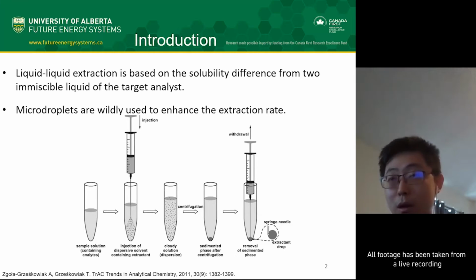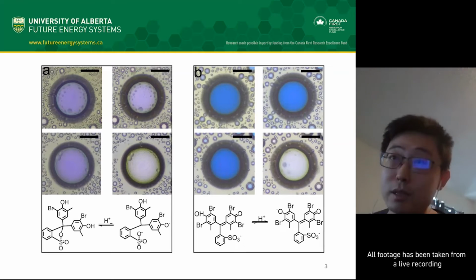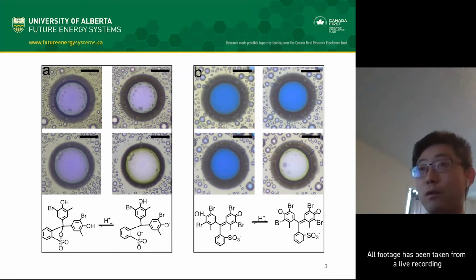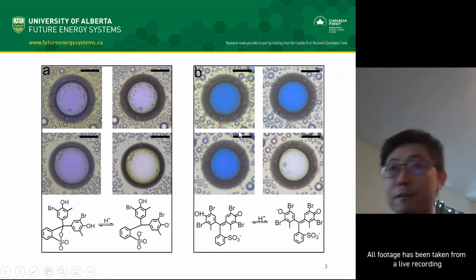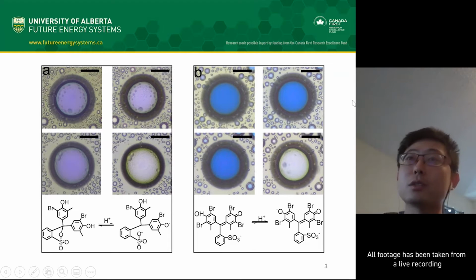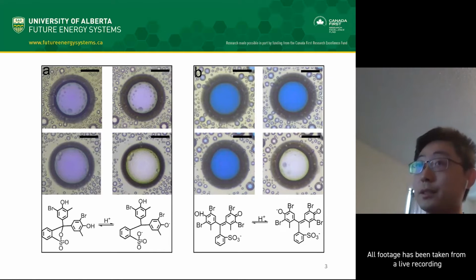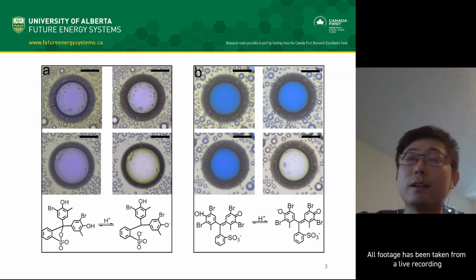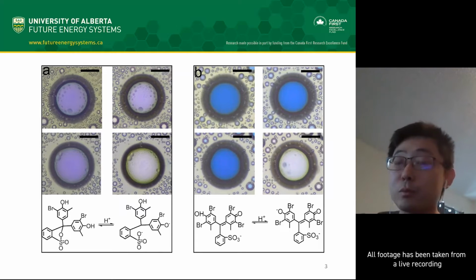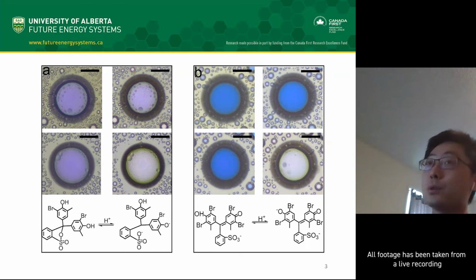To overcome those drawbacks, we apply surface nanodroplets to the extraction of organic acid in the oil phase. Here we show that we can form surface nanodroplets with color. The color is given by a pH indicator, and the phase of the droplet is liquid. Because the droplets are surface pinned, they have a very long lifetime and are very stable, which allows us to achieve in situ detection.